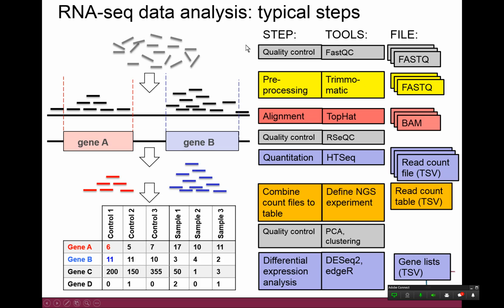In the very first phase, these raw reads are in FASTQ files, so you get those from your sequencing facility or sequencing device, and you usually get as many FASTQs as there are samples, so there are a bunch of these files. Then you can, if you want to, do some pre-processing. For example, in our example session we use Trimmomatic to do some trimming to our reads. After that you still have a bunch of FASTQ files.